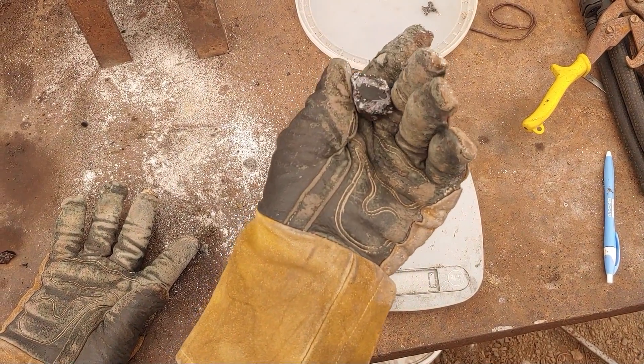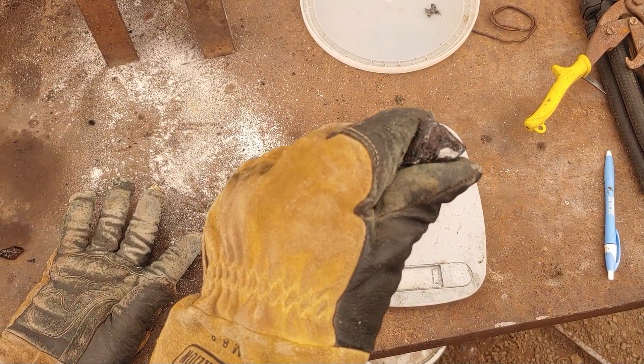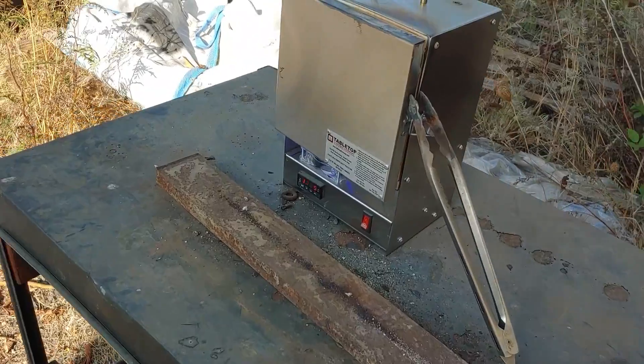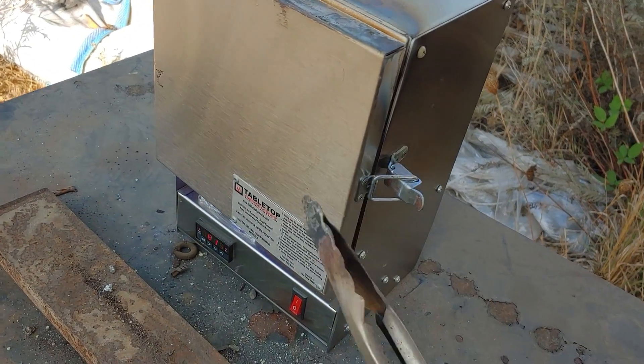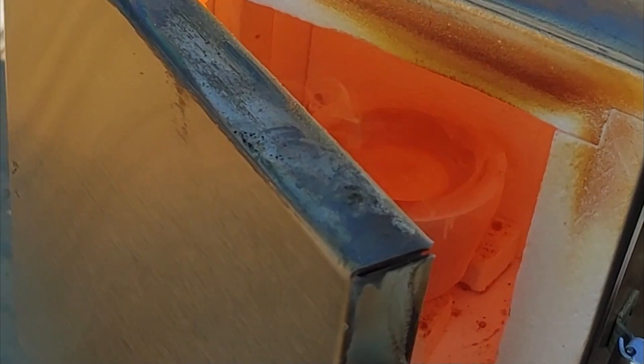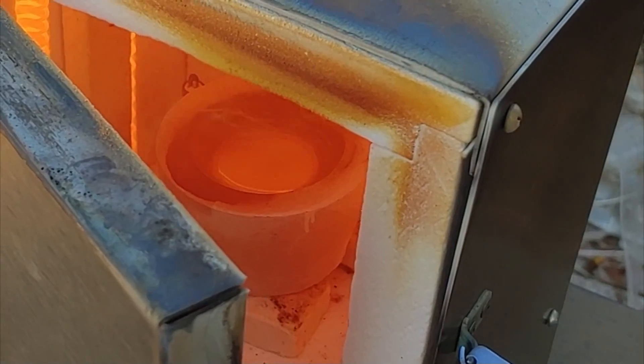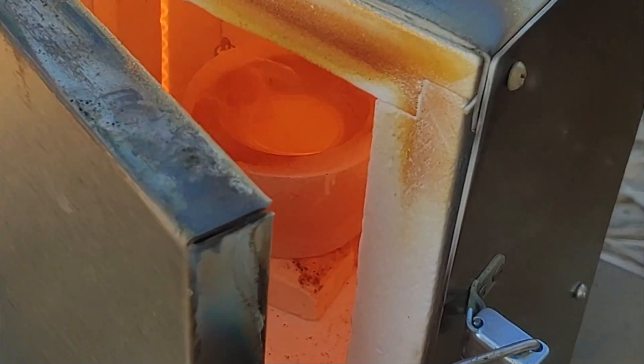Once that other one is done in the cupelling furnace, we'll get this one in there and then we can compare bead sizes. Let's check on our first one here — it's in there, it's getting smaller. I'll let that one go a little bit and then we'll put the next one in.